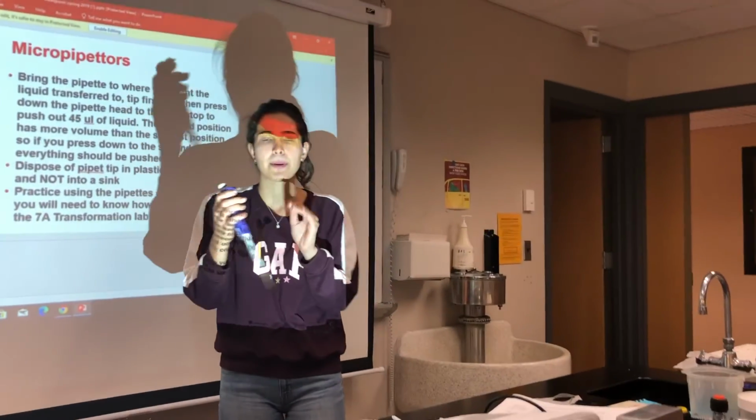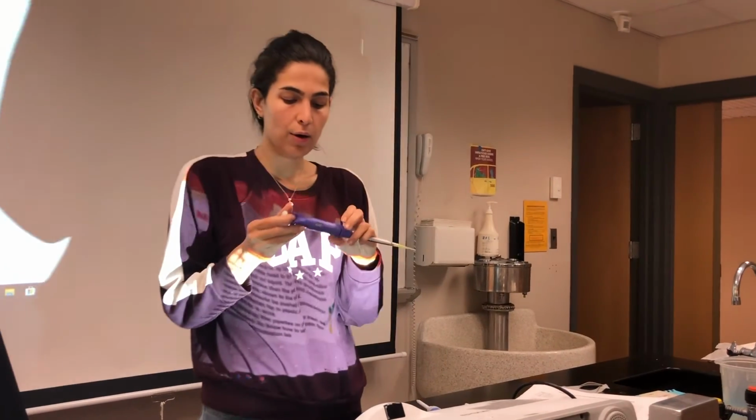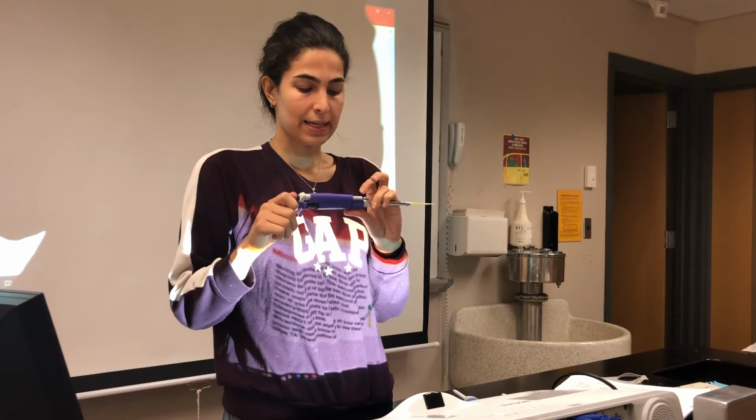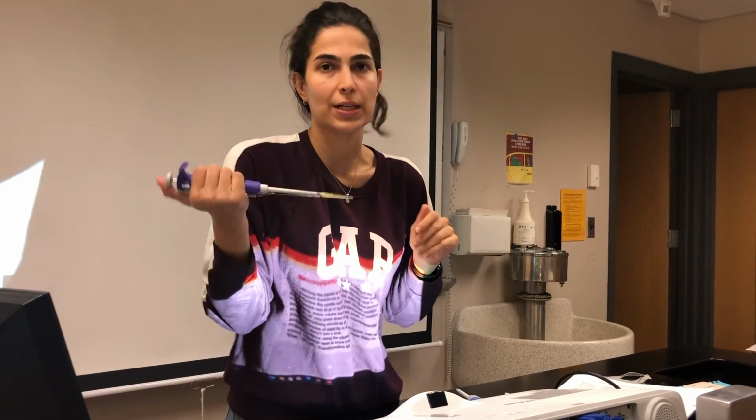So this is all about the micropipette, but you should know how you need to read the volume, what is the range, and how you should transfer the volume.